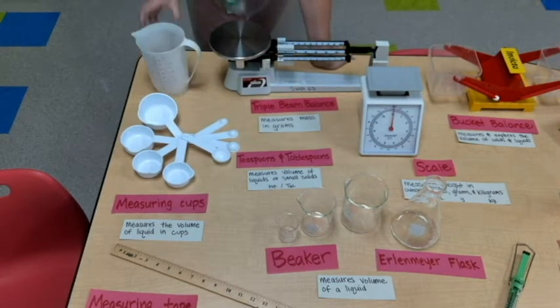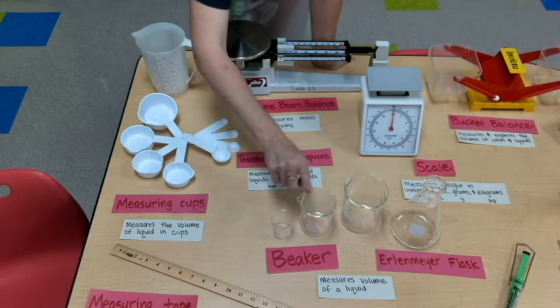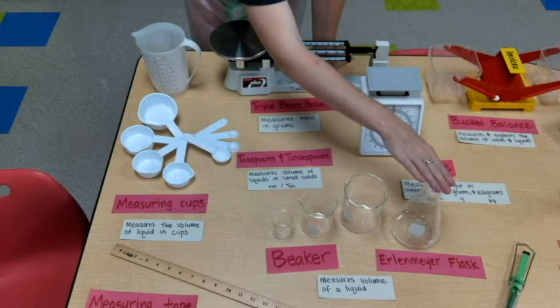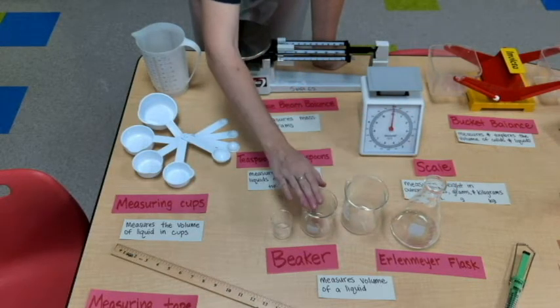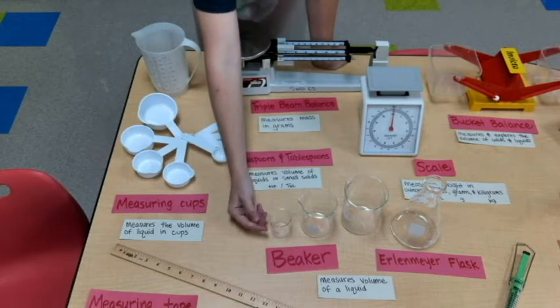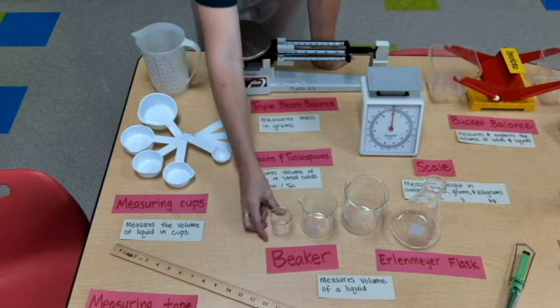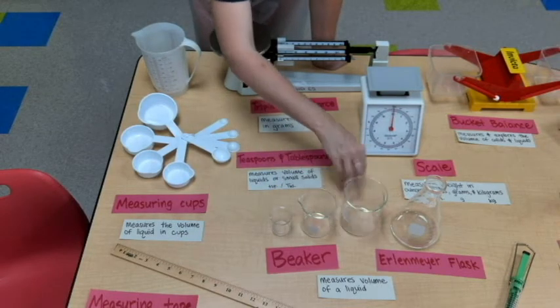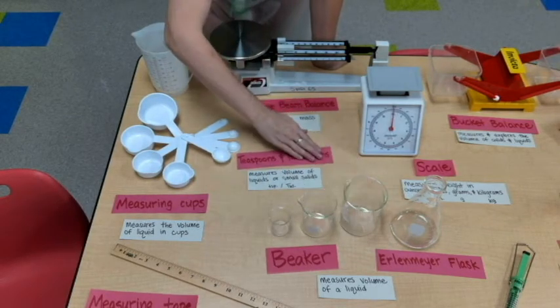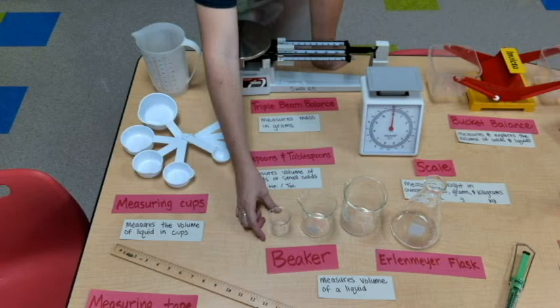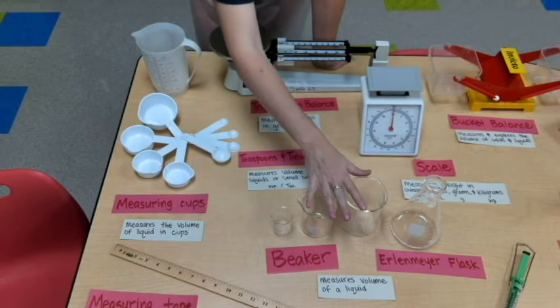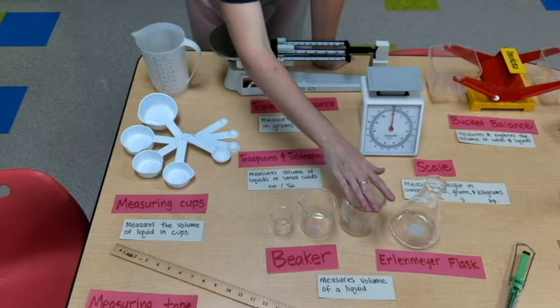And then we have beakers. Here's a little small size, medium, and a large size, and an Erlenmeyer flask. You are able to put liquids in here, and it does have measurements in milliliters to see the volume of a liquid. But we also use beakers in the science lab to hold liquids, to stir liquids, to heat up liquids. So beakers actually have a lot more uses than just measurement.